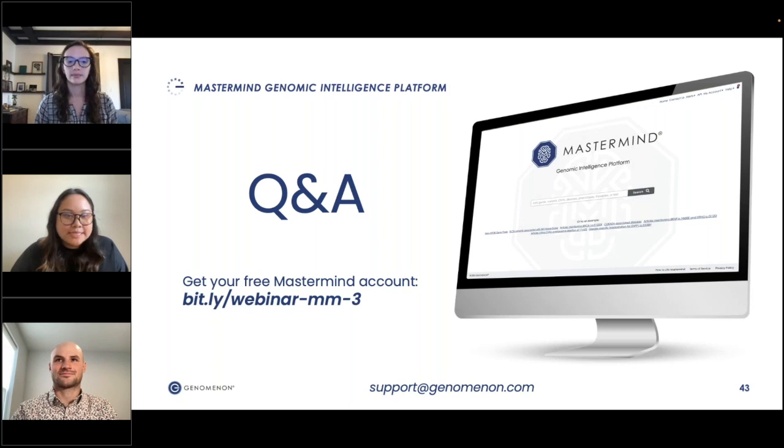Let's see. For Dan, how can I see what transcript a variant is on from within the variants table? Just to give a little more context to this question, when you are looking at the variant diagram and you can see all the variants at that position, Mastermind is not making any decisions for you on what transcript you're interested in. So when you look at position 50, you might see arginine at 50, but on some other transcript, there might be a different amino acid at position 50. So you might also see tryptophan 50 or something like that. So how can users tell in the variants table, when they're looking at a discrete missense variant, what transcript that one is on?